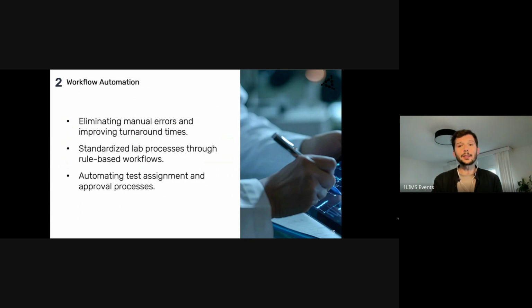Another point is that compliance is, for today's quality control and quality assurance laboratories, non-negotiable for any lab technician, lab manager or quality control manager. Whether you are dealing with ISO, FDA, HACCP, or other industry standards, maintaining proper documentation is essential.